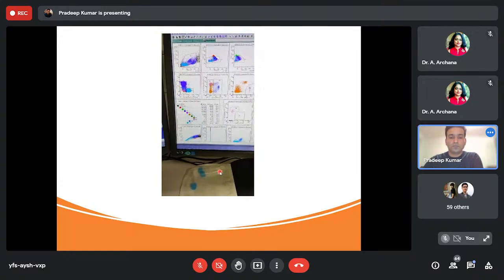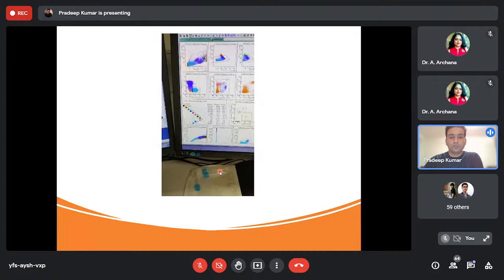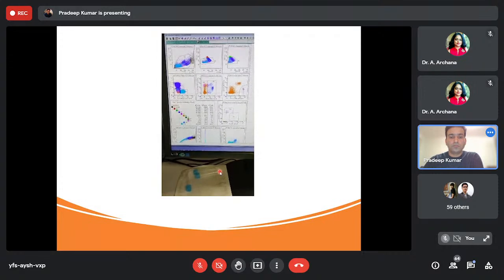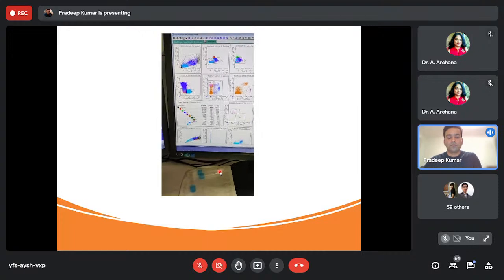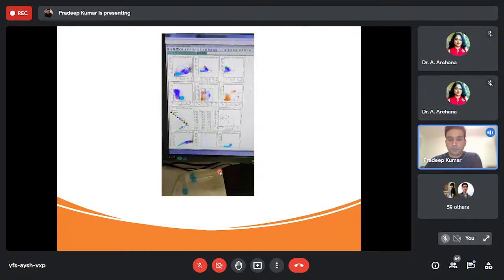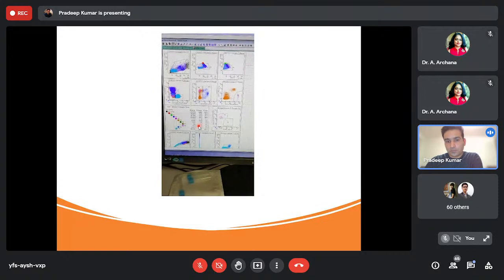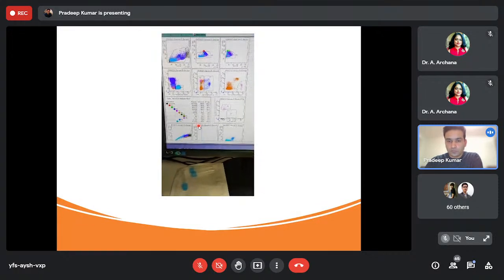These fluorophores are conjugated to antibodies. Those antibodies are monoclonal antibodies, which means they bind to specific cells, and they are not going to bind if the marker is not present on the cell or inside the cell. For example, CD3 marker, CD4 marker, CD8 marker: these are markers of T cells, T helper cells, and T cytotoxic cells. Those are different types of populations that you look at.